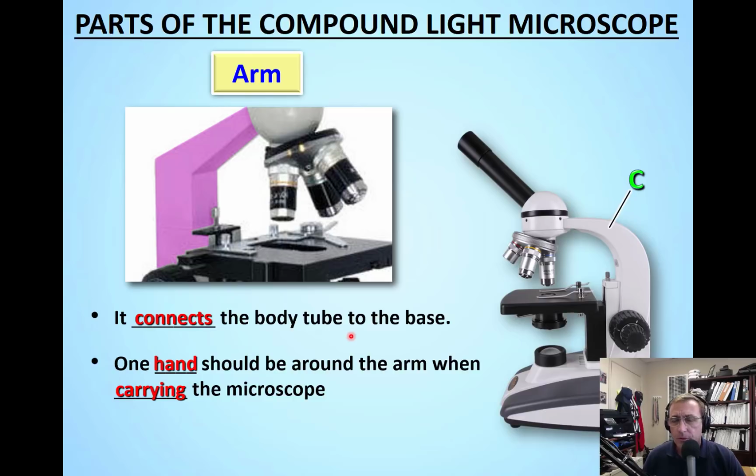I don't know that you guys will be moving the microscopes, but some of you might be helping bring them out or put them away or both. And you must be careful with these microscopes. Again, the student ones are not terribly expensive, but I don't know if you want to be dropping $100 to replace them if you break them. So please be careful. And plus, you just don't want to break it because then we don't have enough for everybody.